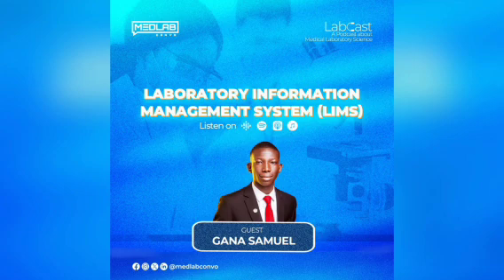And the third one, of course, is open source. Open source is the one that most people use. In fact, the licensing fee is very low and it's very cheap. So, as a scientist wants to start, or as a facility wants to begin using LIMS and looking at cost, I feel that they can use a cloud-based LIMS.